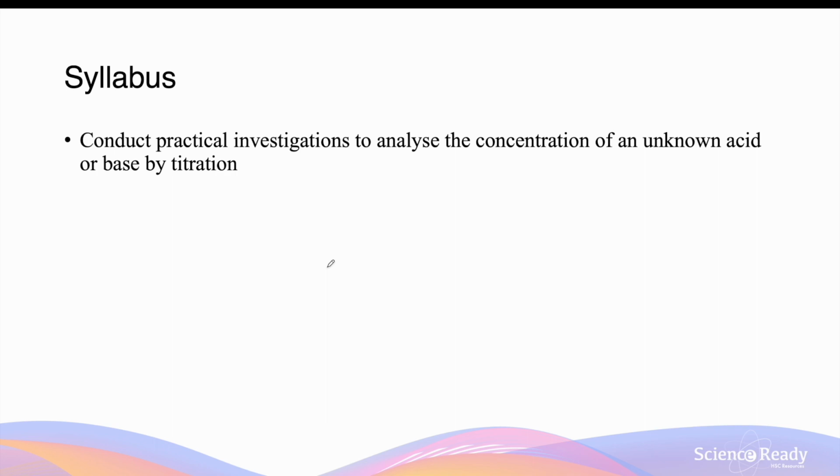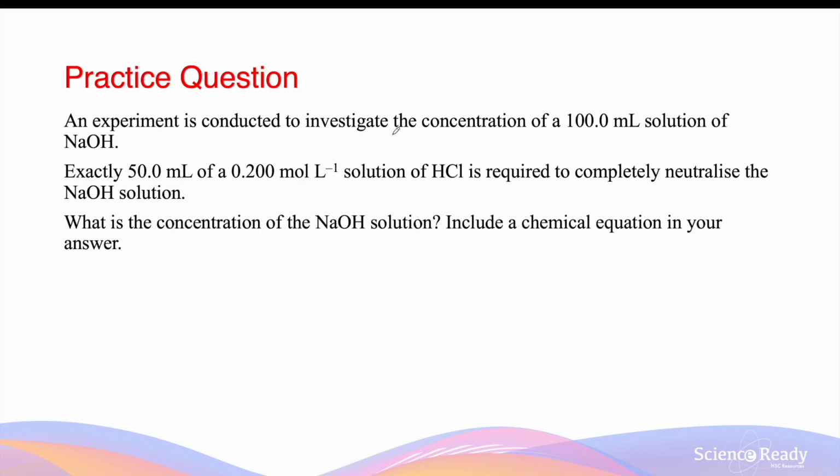Hello everybody, this video is on preparing for titration. An experiment is conducted to investigate the concentration of a 100 milliliter solution of sodium hydroxide. Exactly 50 mL of a 0.2 mol per liter solution of hydrochloric acid is required to neutralize the solution.